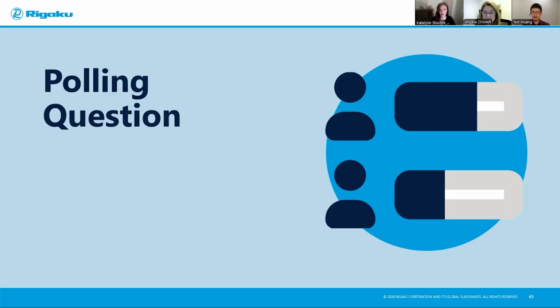Okay. Thank you, Angela. And again, thanks everyone so much for answering the poll question. It tells a lot. And it's kind of what I expected, it makes sense because resolution is whether you can see or cannot see what you're trying to see, right? It's very important. You have to be able to see it. And then the sample size, because if you want to use CT, chances are you're also very keen on keeping it a non-destructive technique.